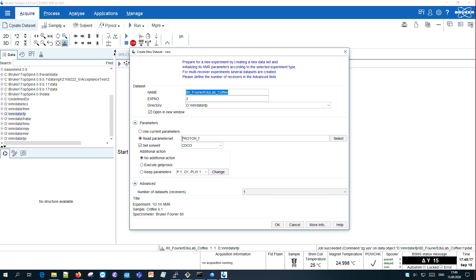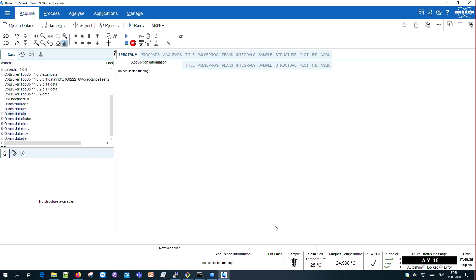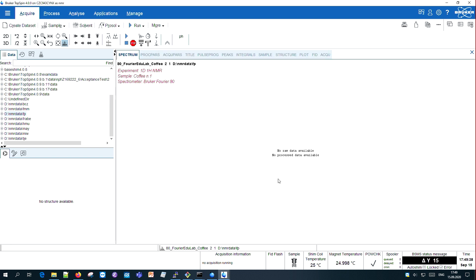Sample is in, and now everything is ready to acquire our experiment. To do that we use TOPSPIN. You could also use GoScan, our push-button solution that would make acquisition very easy.